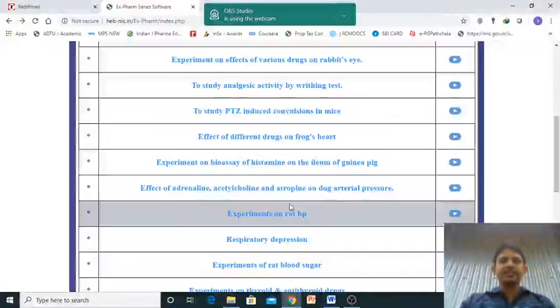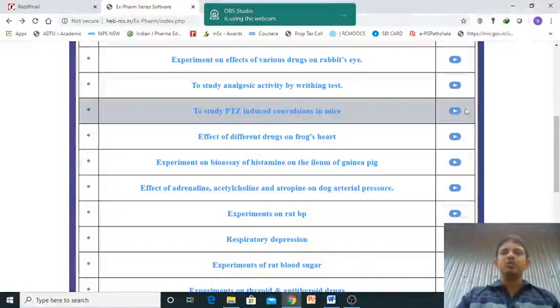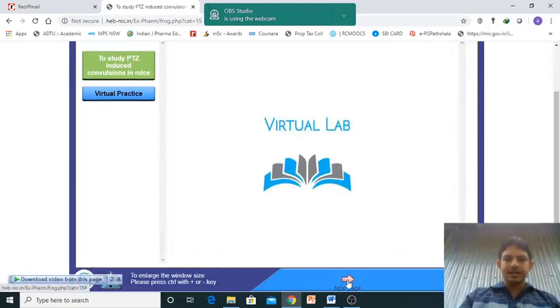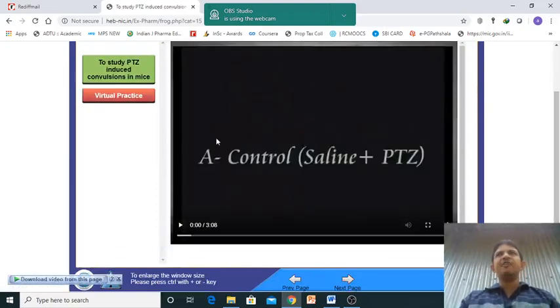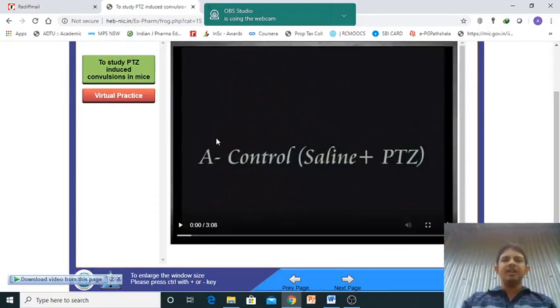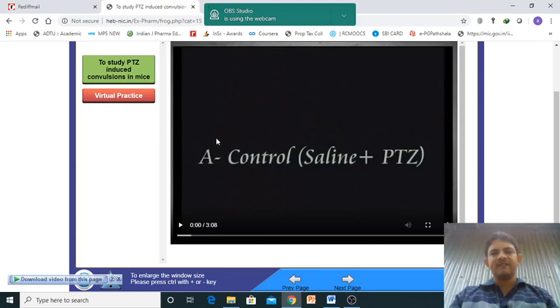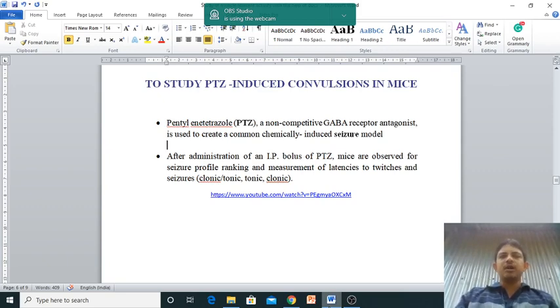Good morning. In our next experiment, we will study the PTZ-induced convulsion in mice. This is the video you need to observe — how it works and what it is showing. There are different modes, as I mentioned in the earlier experiment, to produce the convulsion.